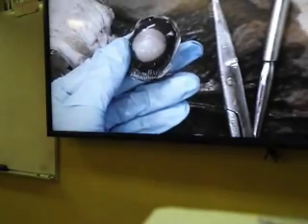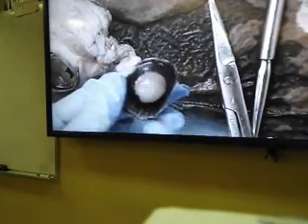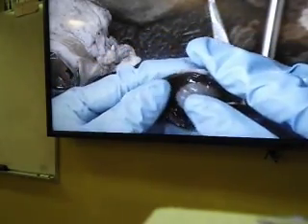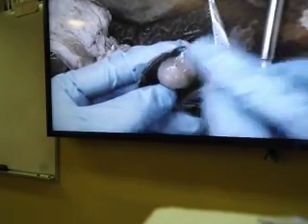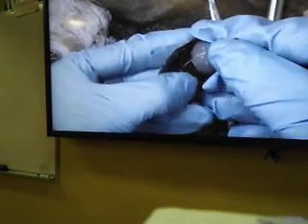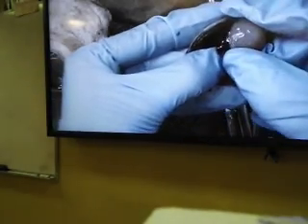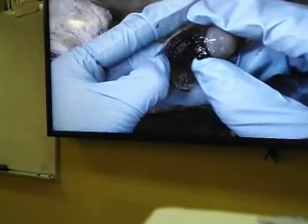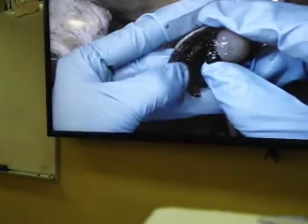When I am seeing the anterior cavity, I see this structure which is the lens, and surrounding the lens there are other structures as well. So what I want to do first is take the lens off. Unless I take the lens off, it will be harder for me to see the other structures in the anterior cavity. I want you to pay attention when I am taking the lens off. You see a little bit of transparent structure that is holding the lens, which is coming from this black area which has ridges in it.